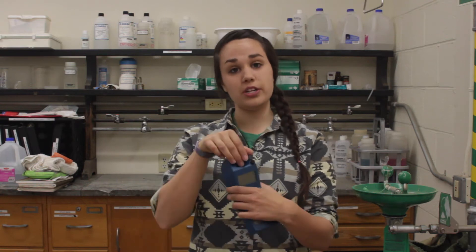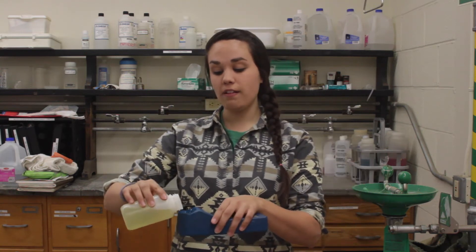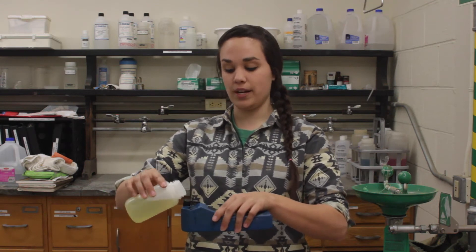To start the calibration process, we're going to open the well on our meter, and we're going to begin with that neutral solution with pH 7. We're going to fill the well of the meter three times and empty the solution. This is called a triple rinse.